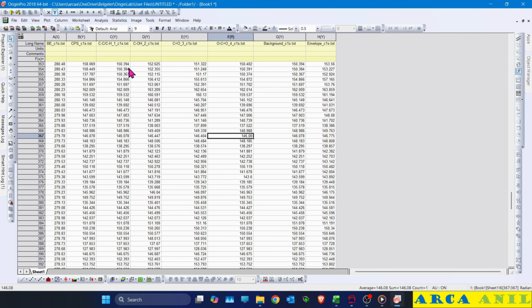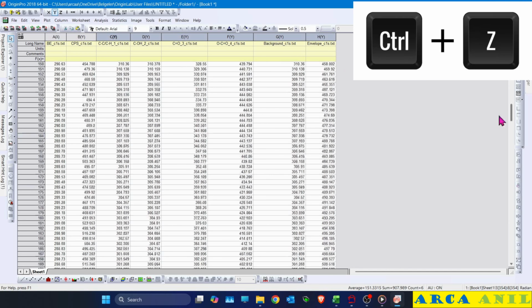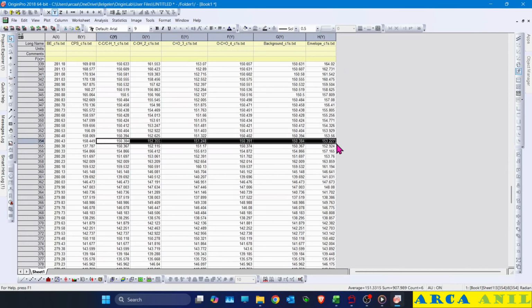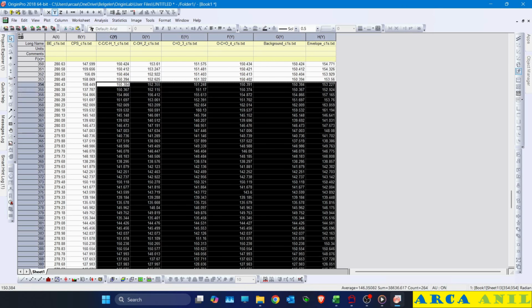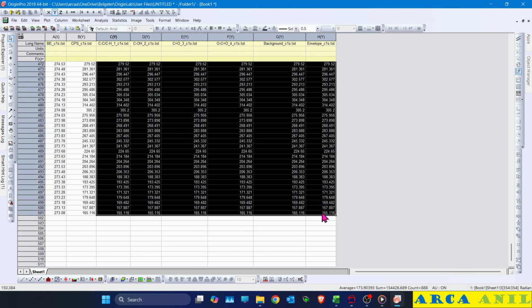Unfortunately, I have to make it again. So right now, the data came here again. Okay, good. I will delete it again. Hopefully. So if you make a mistake, of course you can correct it very easily with Ctrl Z. There is nothing fancy here.